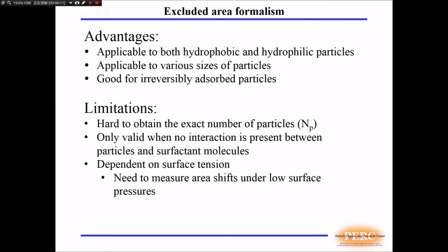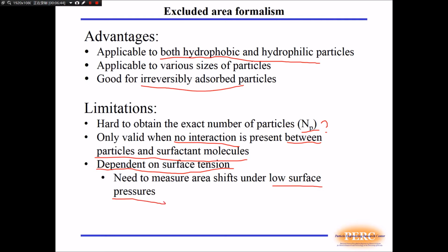The excluded area formalism is applicable to both hydrophobic and hydrophilic particles in a wide range of sizes, and it is good for particles adsorbed irreversibly. The limitations of excluded area formalism are listed below. It is difficult to know exactly the number of particles at the interface. It is only valid when there is no interaction between particles and the surfactant molecules. Contact angle is dependent on surface tension, and it is necessary to measure area shifts under low surface pressures to minimize the effect of surface tension.